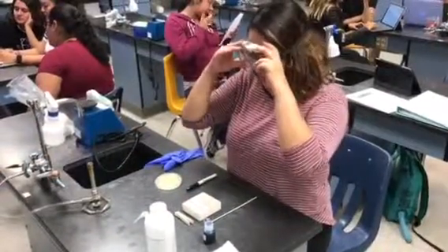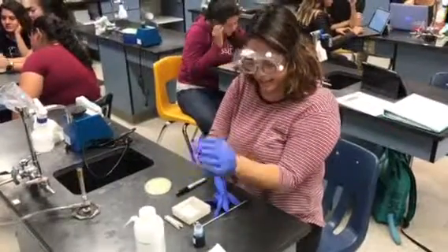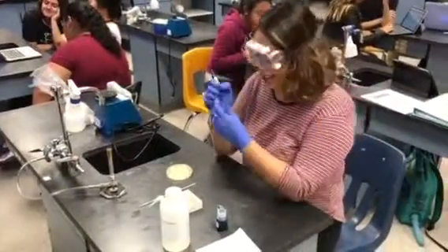Hi guys, welcome to BIO 124. Today we're going to be showing you how to do a simple stain. Since we are using a Bunsen burner, make sure that you put your safety goggles on. I am also going to be using gloves since I don't want to contaminate the slide with my own bacteria and stain that instead of the actual bacteria we're working with.